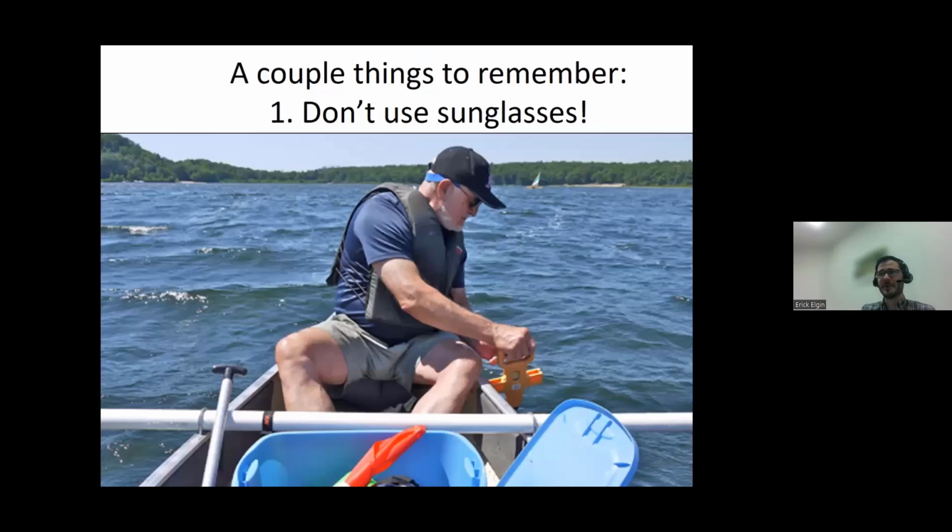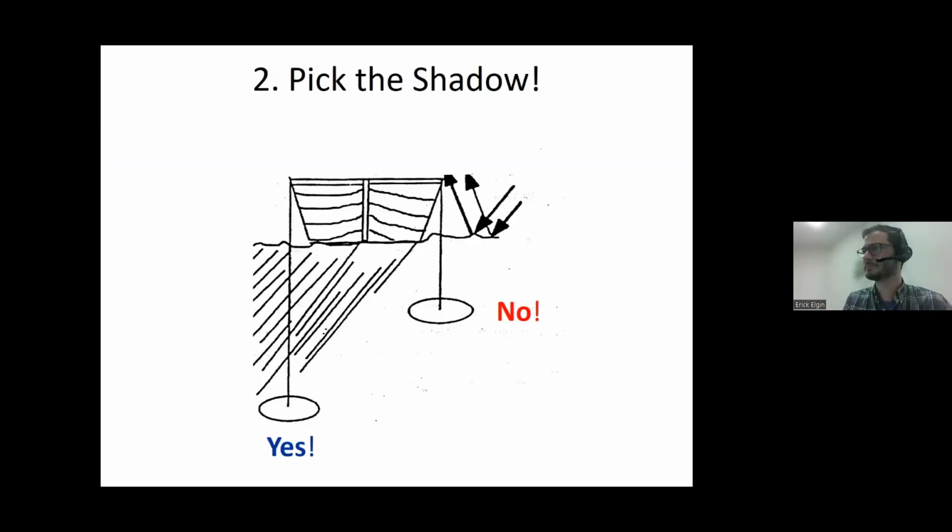So again, a couple things to remember: don't use sunglasses. That can impact how far you see, and then therefore would give you inconsistent measurements through time. Because let's say you have sunglasses on one time and you don't another. So we want to have consistency with our long-term monitoring. Also, pick the shadow side of the boat. If you're doing this at high noon, that becomes problematic because there's really no shadow, but you want to be consistent. And if you go on the sunny side of the boat, you can get a lot of reflection off of the surface of the water, and that'll impact how far you can see it.